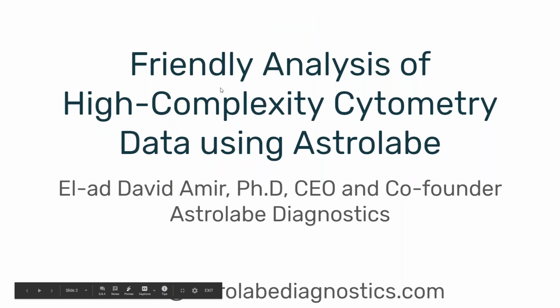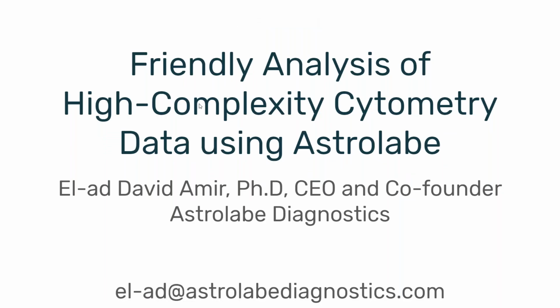So thanks again, Janelle. And today I'm going to tell you about the Astrolabe Cytometry platform for analyzing your flow cytometry data, and specifically the Cytek Aurora.